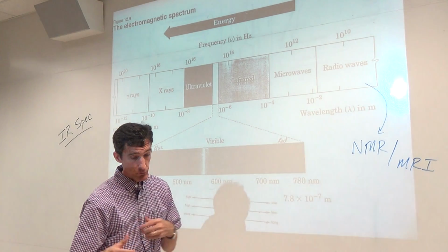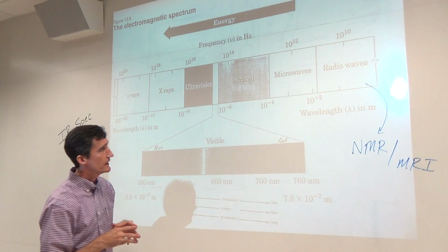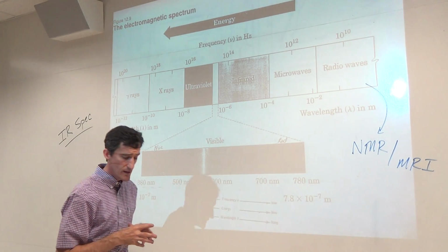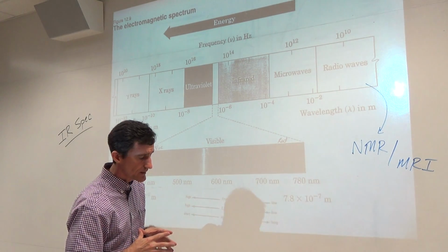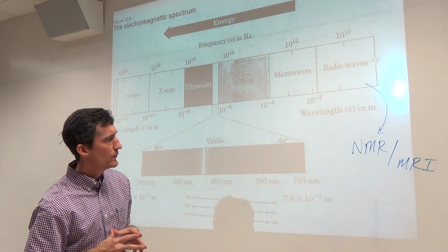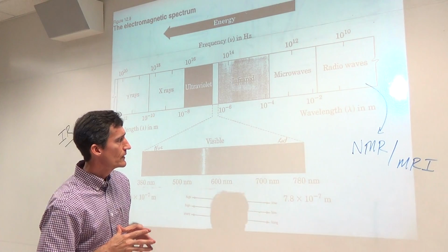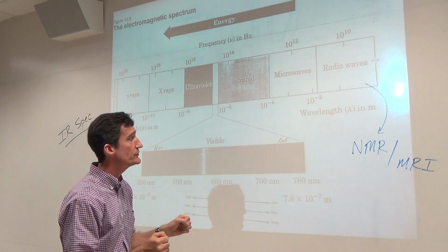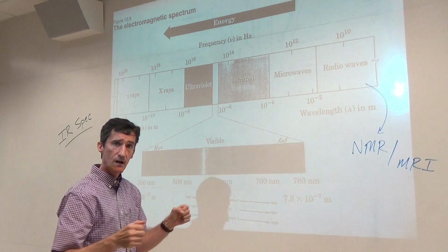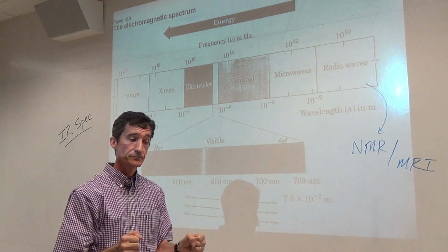I'll illustrate it sort of with my hands here as I do, but I'll also show something on the web that shows some prettier pictures with some actual vibrations going on. Okay, the most common is your stretch. The peaks that we assign usually come from bond stretches. Okay?